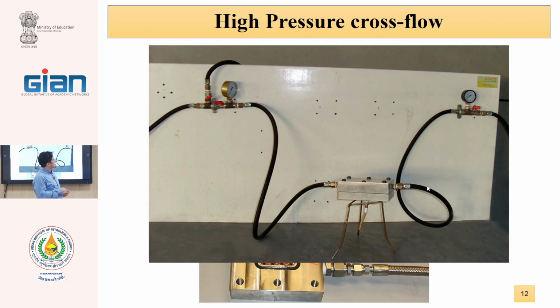When this valve is completely open, we have no pressure. When we begin closing, the pressure increases, and this is a bypass. With this bypass, we also control the flow of the fluid that passes over the membrane surface.